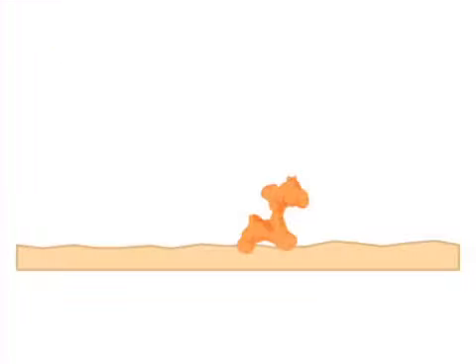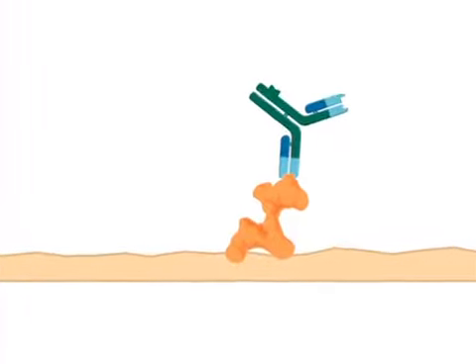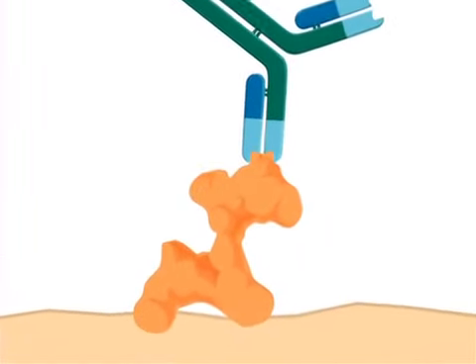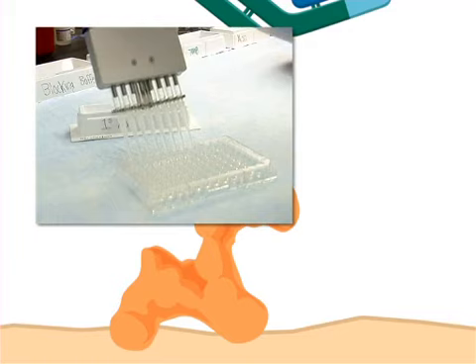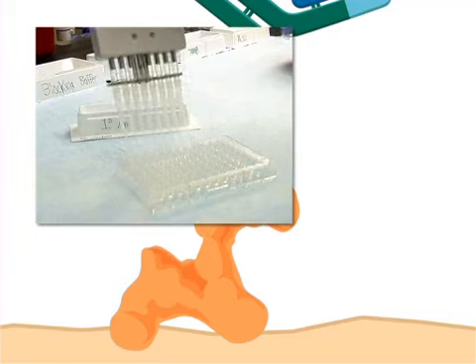In an ELISA, the antibody that directly binds to the target protein is the primary antibody. It has a high affinity, that is, a high ability to bind tightly for an epitope, a specific region of the target protein. The primary antibody is usually unlabeled or unconjugated.